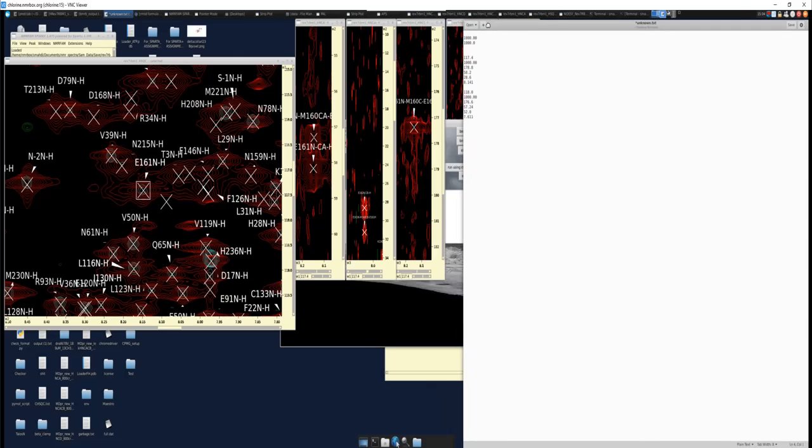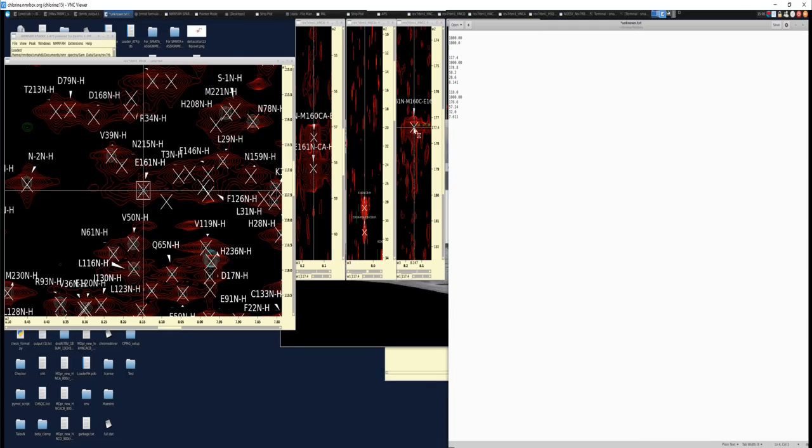So let's bring these down and come up and put, we don't have the nitrogen or the C alpha, but we do have the carbonyl. So let's move this here. So this is 177.4. C alpha is 57.3.